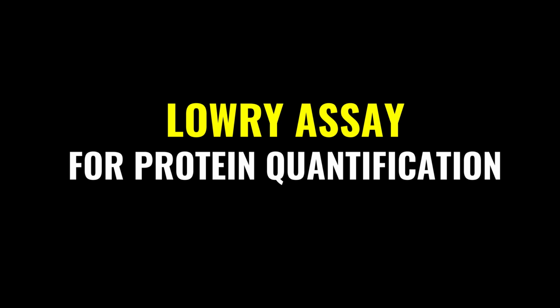Hi, welcome to this video on Lowry assay for protein quantification. This is a commonly used method in any biochemistry, cell biology or molecular biology lab. This was published in 1951 by Lowry et al. in the Journal of Biological Chemistry. Therefore, this is a gold standard method.